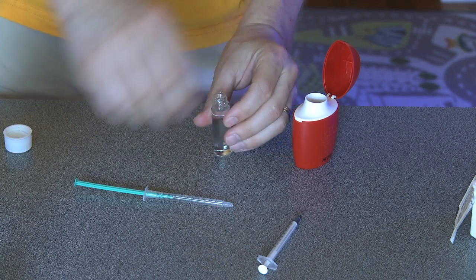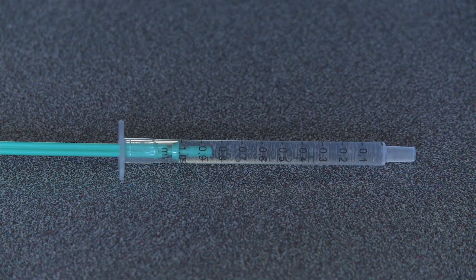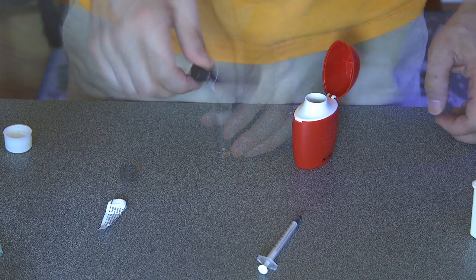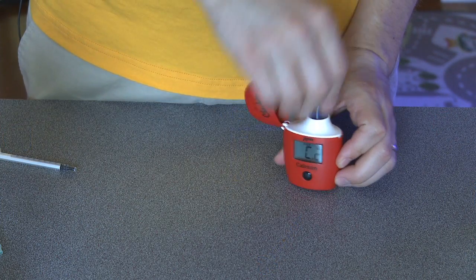Next, take out the vial and add 0.1 ml of water from your tank to the vial. The easiest way to get exactly 0.1 ml is to put a full ml of water in the syringe and then press the plunger down to the 0.9 ml mark. Then add 1 whole packet of Reagent B to the vial, cap and shake. Wait 15 seconds for the air bubbles to settle, then place the vial on the checker and press the big black button.